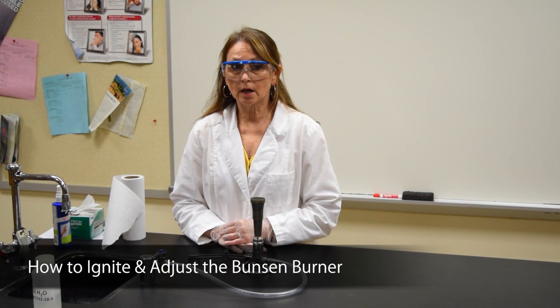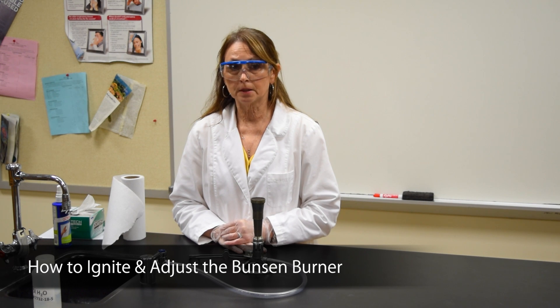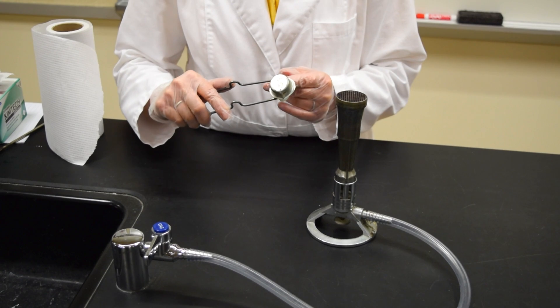The purpose of this demonstration is to show you how to ignite and adjust the flame of your Bunsen burner. You start by taking your gas striker out of your drawer.